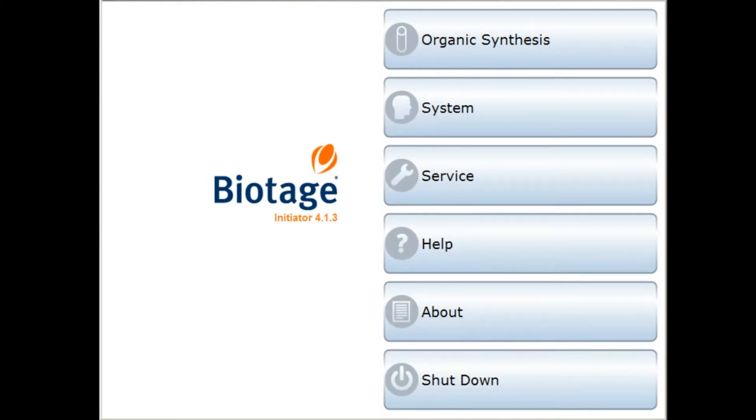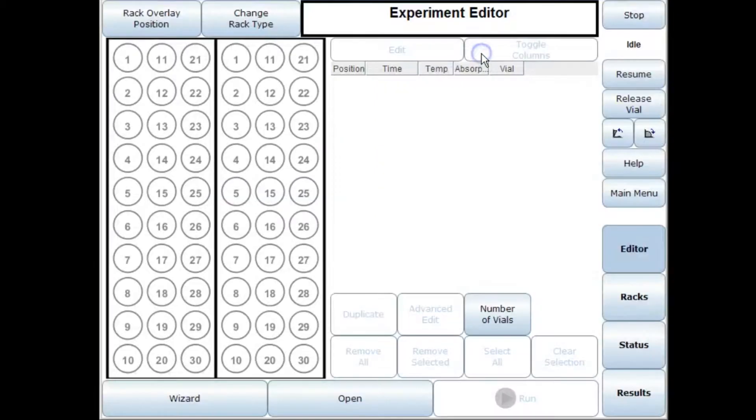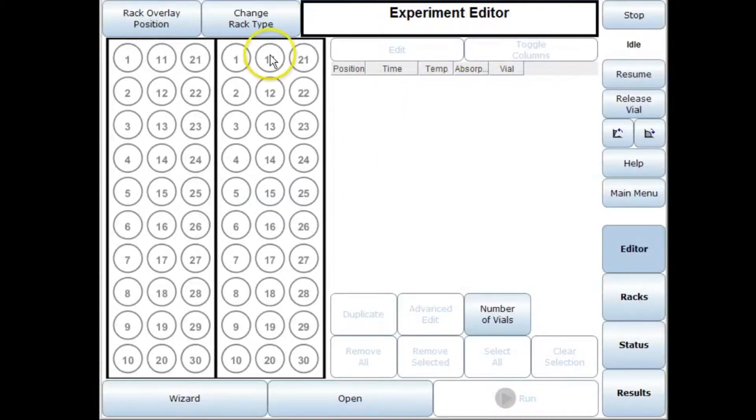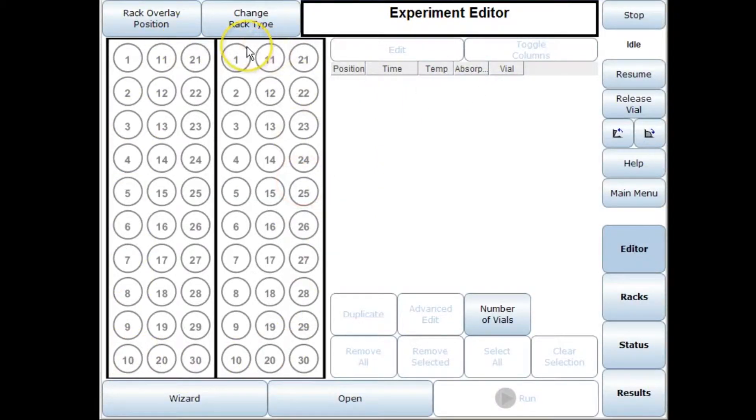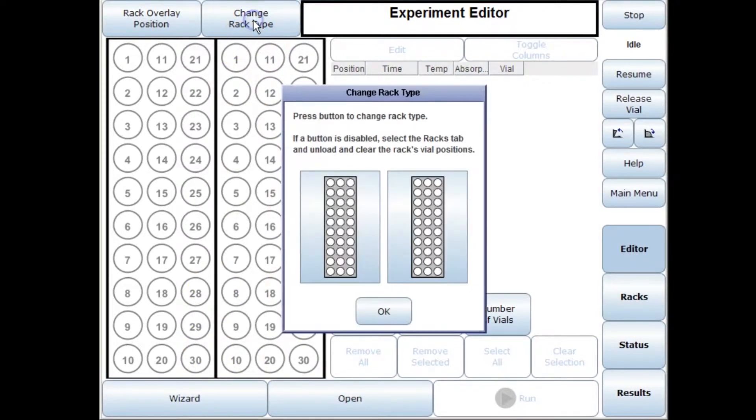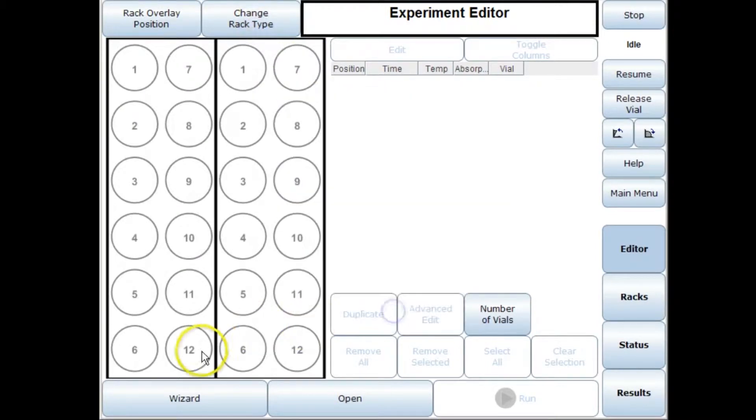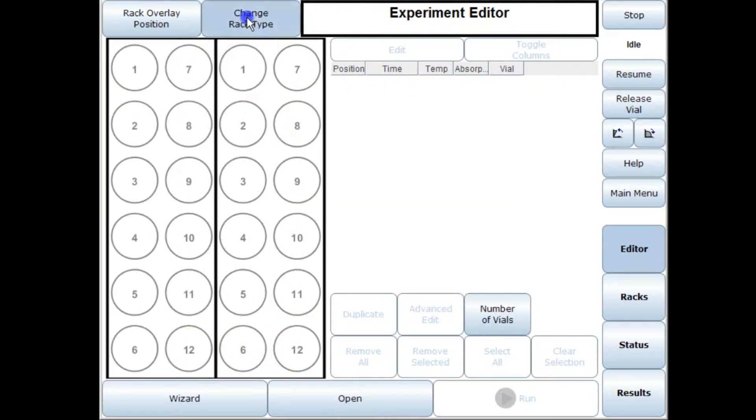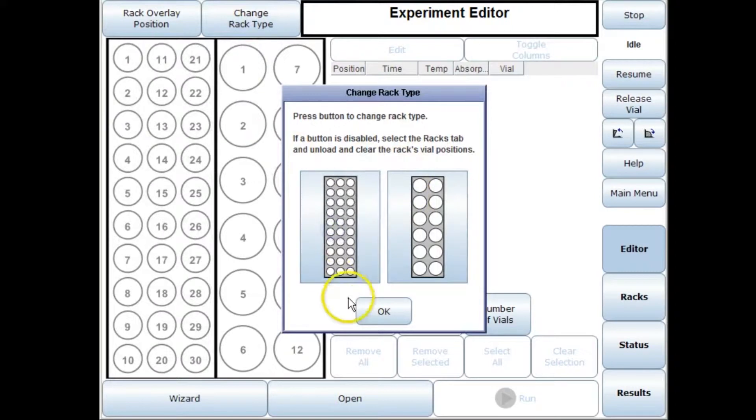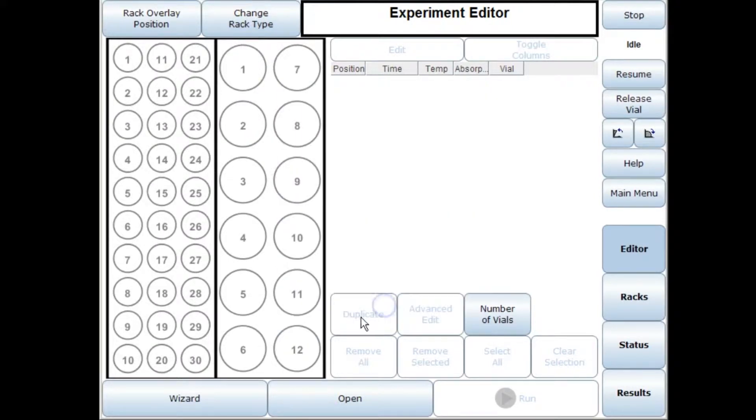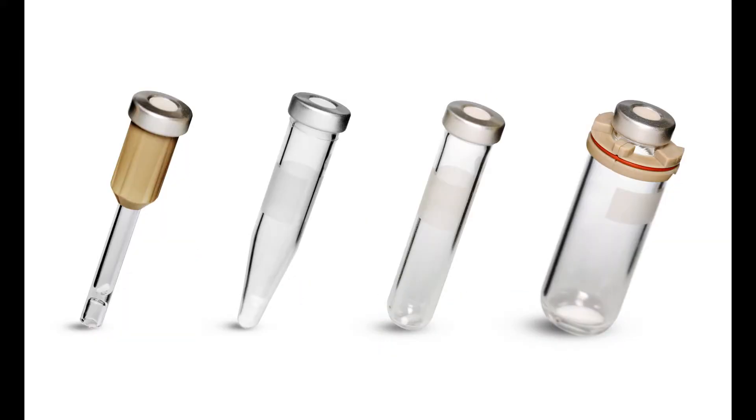In this tutorial I'm going to go through some of the advantages of having automation on your Initiator Plus 60. On the left hand side here you have an overview of the rack positions. We have up to 60 positions for the smaller three vial sizes or if you wanted to use a larger vial you have 24 positions. It's perfectly possible to have both different rack sizes on the system so that you can run reactions on all four vial types without having any changes.